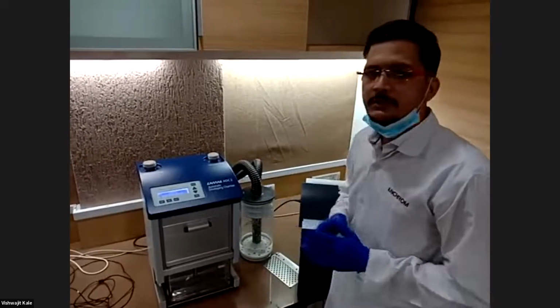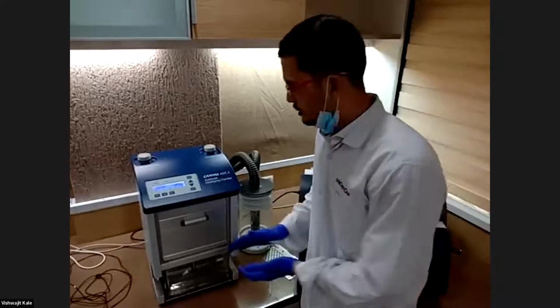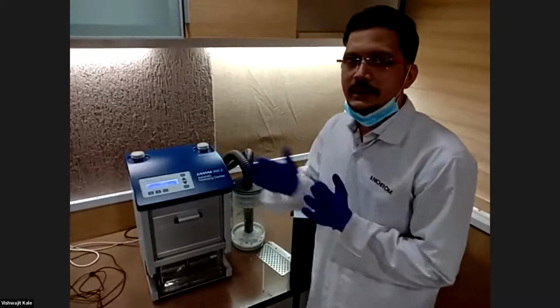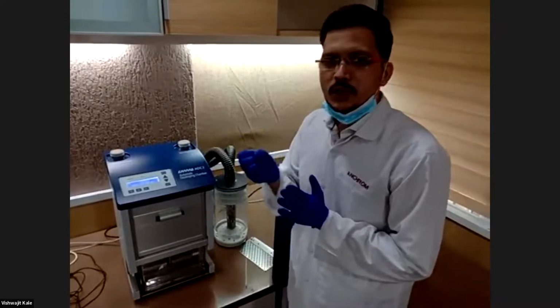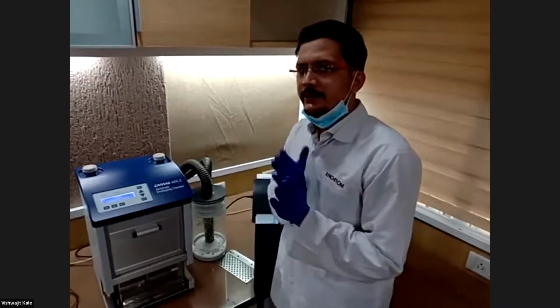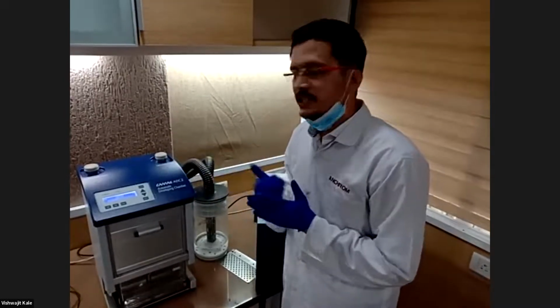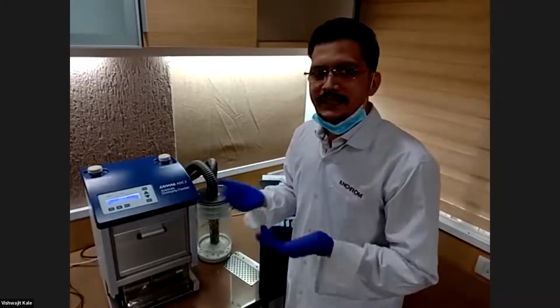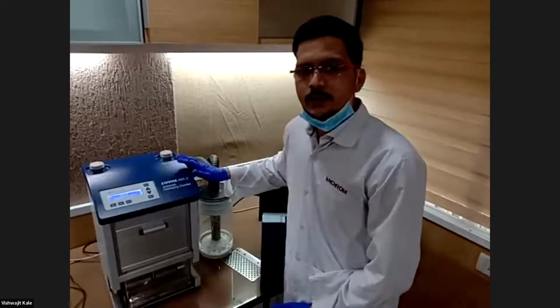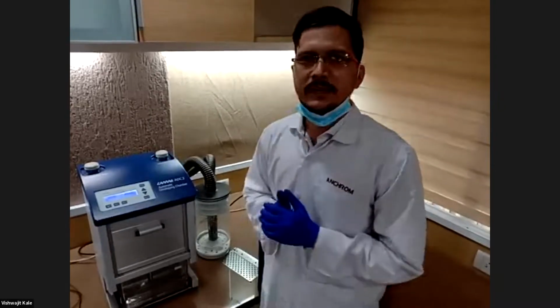We can fill this jar with molecular sieves also to control humidity exactly at 0% during chromatographic development, because humidity also plays very vital role in development. If our stationary phase contains more molecules of water on plate, it will be more polar and it will be like more partition plus adsorption chromatography. If we control the percentage of water molecule on plate during development, it will be more adsorption chromatography, and in more controlled environment, we can achieve reproducible results plate to plate and day to day, lab to lab. That is possible with ADC2 only, not in manual development. That humidity control option is not there in manual development.